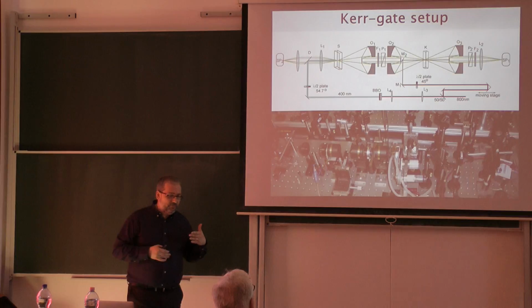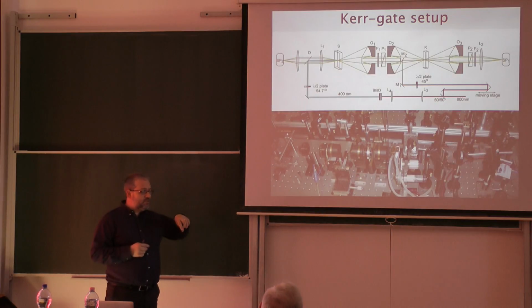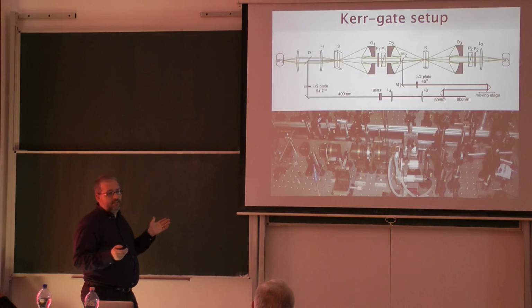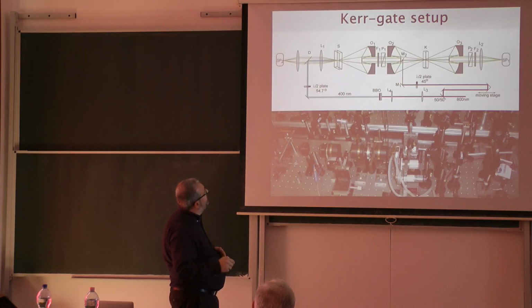that we have to fulfill somehow the so-called phase matching in the case of the nonlinear crystals. So depending on the fluorescence wavelength, we have to change the angle of the crystal if we want to pick up another wavelength that we want to look at. In the case of Kerr gates, this is not needed. We are looking at the whole spectrum, actually. You will see how. This is very easy, actually. It's an easy method. It's a very good method.